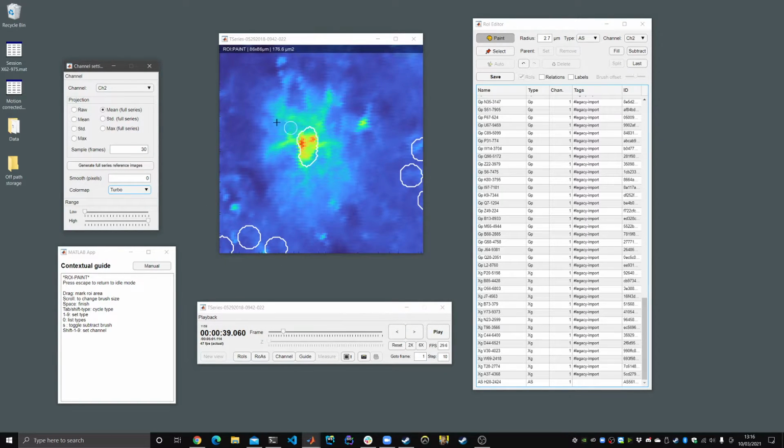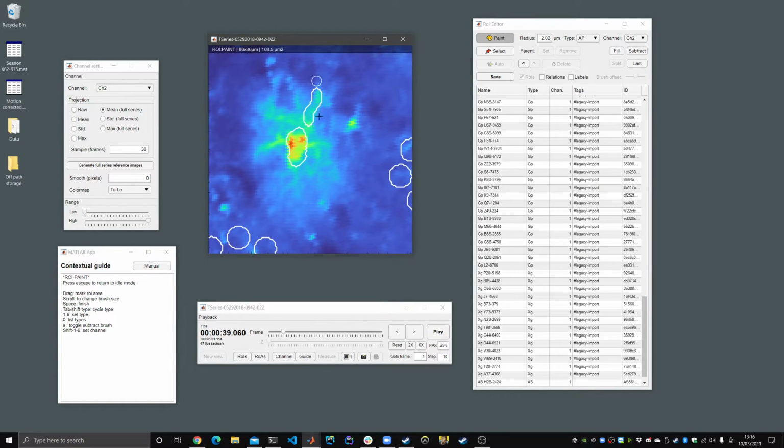Next, I would like to draw specific fine processes around these processes. So what I'll do then is that I'm going to go to astrocyte process. I'm going to make the brush very small, and then I'm going to draw one of them. This one was a bit thick, but it serves as an example.